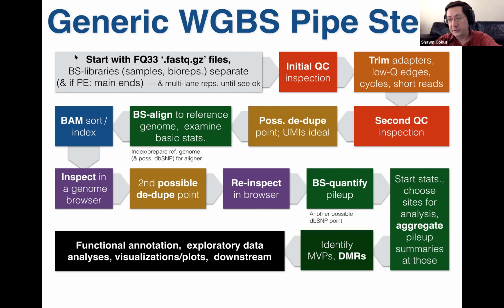With all those things that can go wrong in a bisulfite experiment, you're going to want to look and see whether those reads look good. So there's some kind of quality control inspection that we'll do before we do anything. Then from the results of that, we will probably make some decisions. We may need to trim adapters because we read into them. There may be low quality, per base, low quality edges of reads.